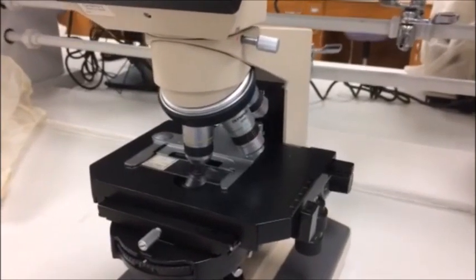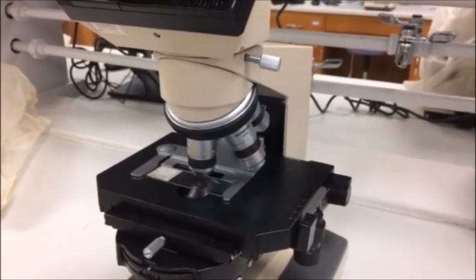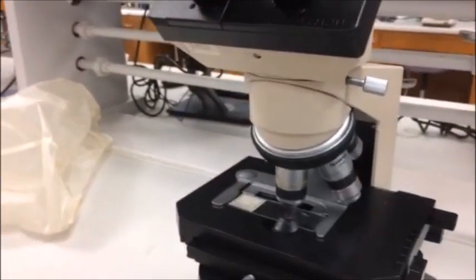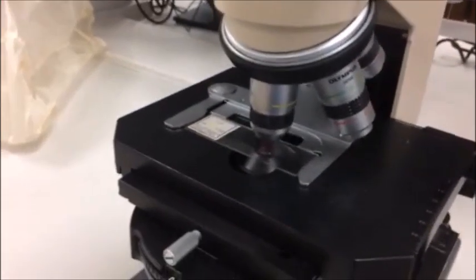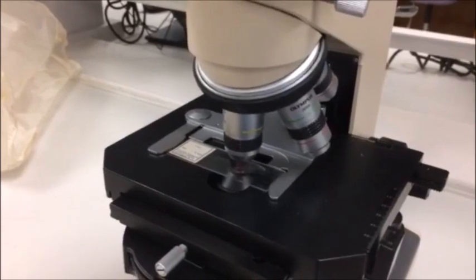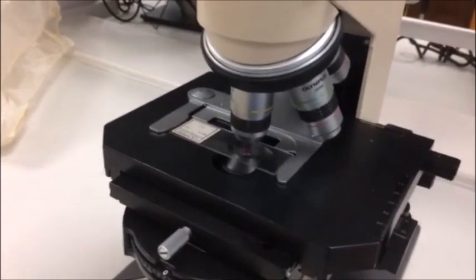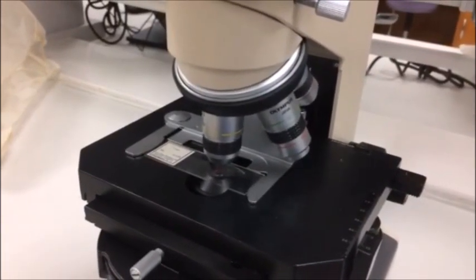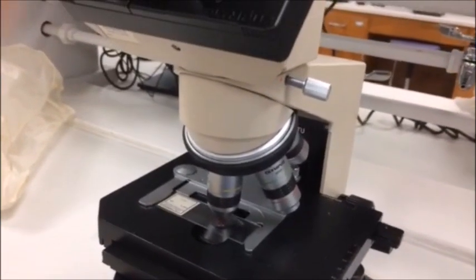So once you have the initial setup of the microscope, the very first thing that you have to do is to actually focus on the specimen. And that's actually one of the more difficult things. On the liver cross-section slide, which we're giving you to start with, it's not that hard because it's a big dark thing. But if you're looking at something tiny like a bacterium or something where there's only a few items and it's on a big slide, then it's sometimes hard to find the thing that you're actually trying to focus on.